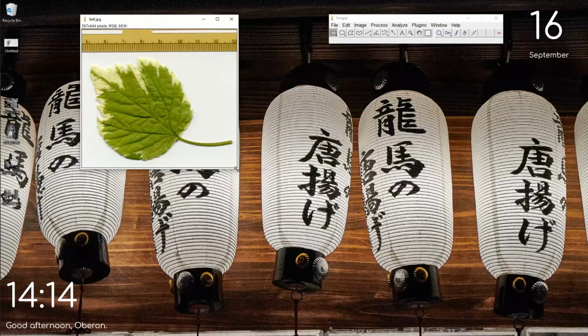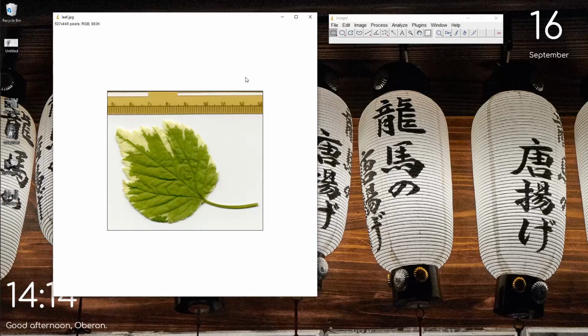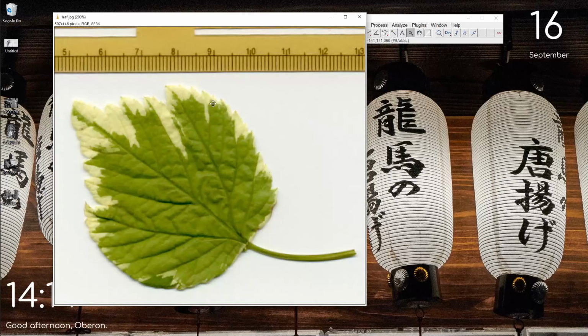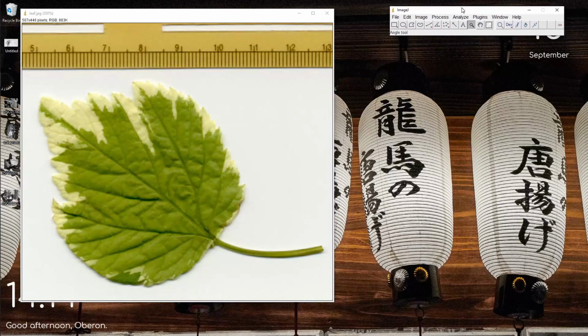So you guys can actually manipulate the window if you want. You can enlarge it or you can zoom into it. So click here if you want to zoom it and so on. Let me just arrange this.